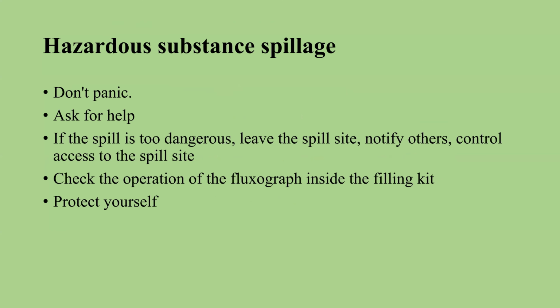In case something poisonous is broken, don't panic. Ask for help, don't run away, and inform responsible people.